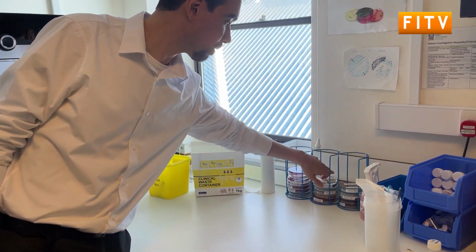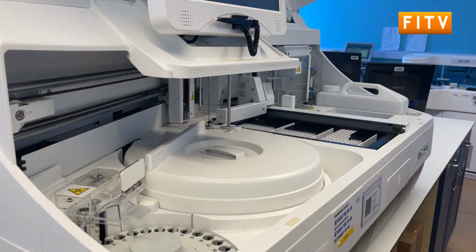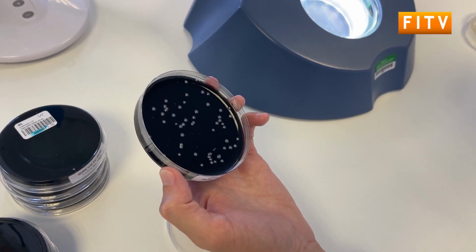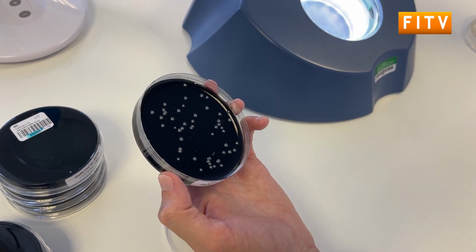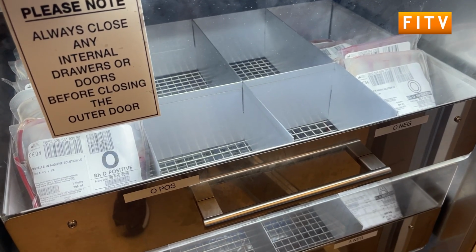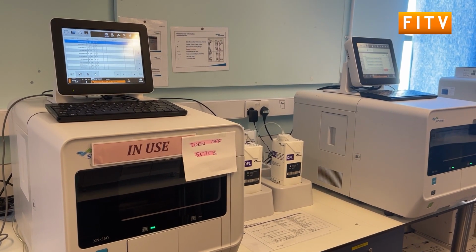In future, we would like to expand the list of tests that we are accredited for to other food and water tests that we may want to incorporate. Obviously we'd move some over to the clinical side as well, to give us that same accreditation, which helps when you're sending samples or results to referral labs elsewhere. They know the standards that you're meeting, and it's not just someone in a lab somewhere randomly generating numbers for you.